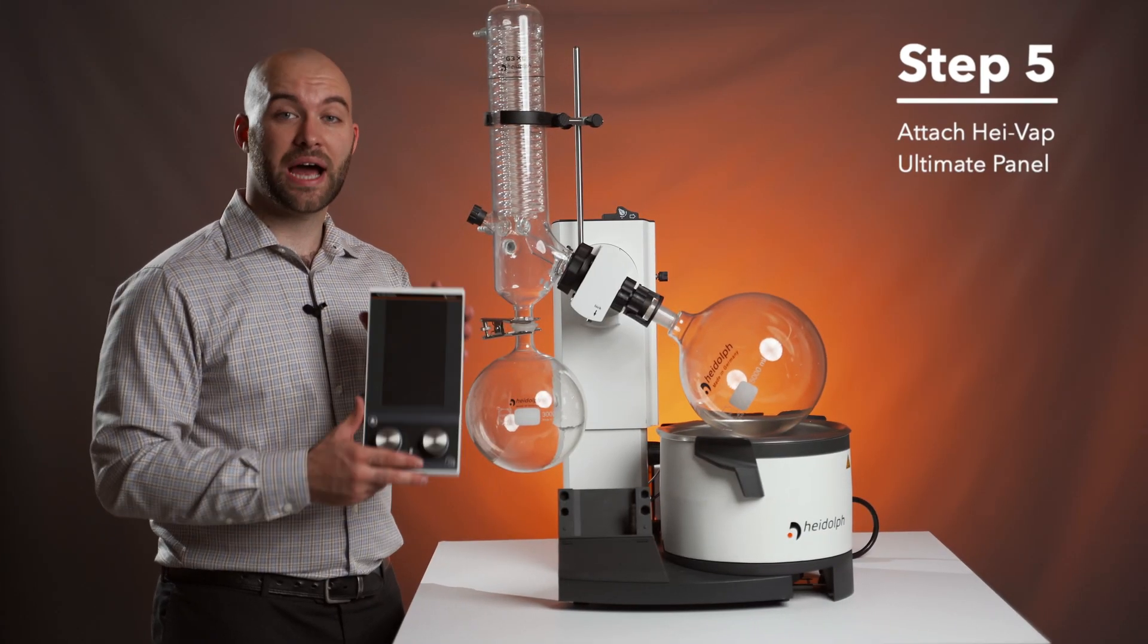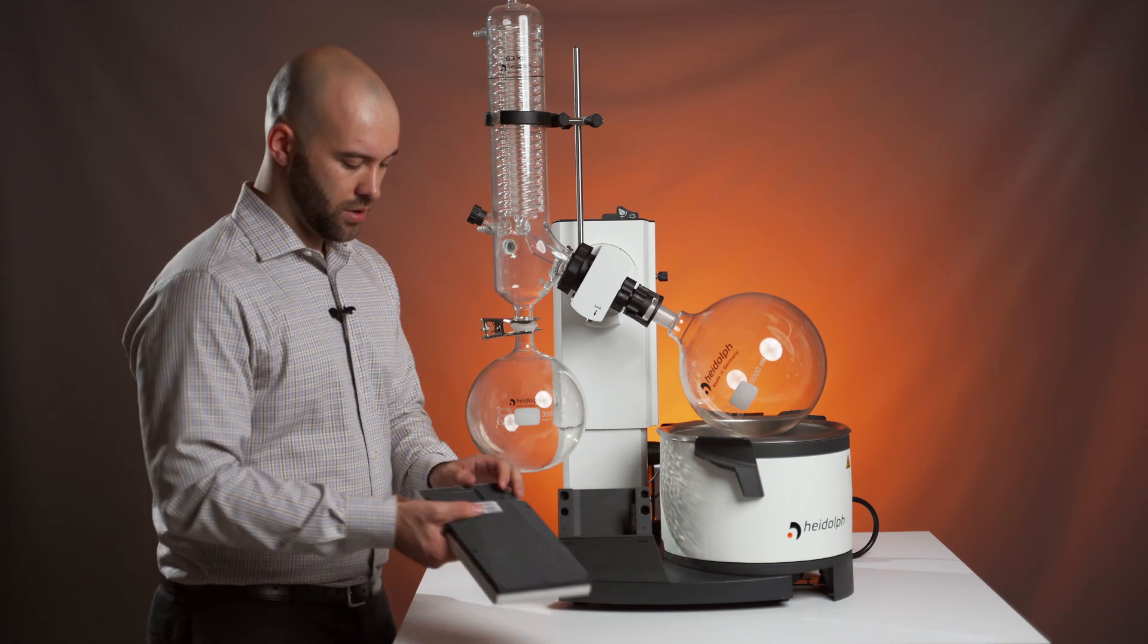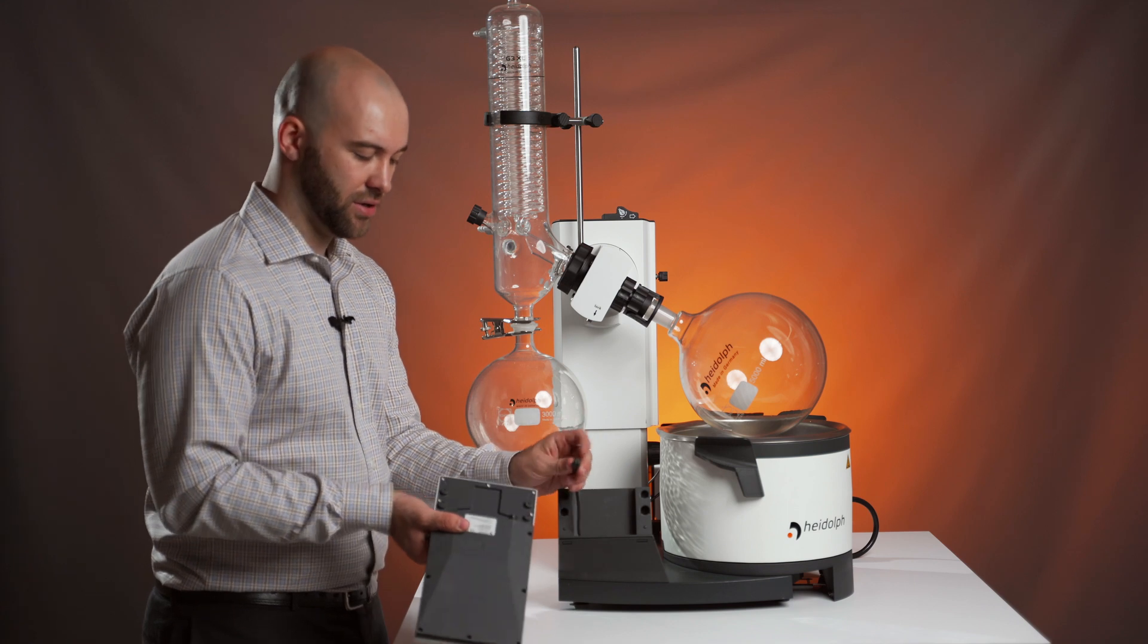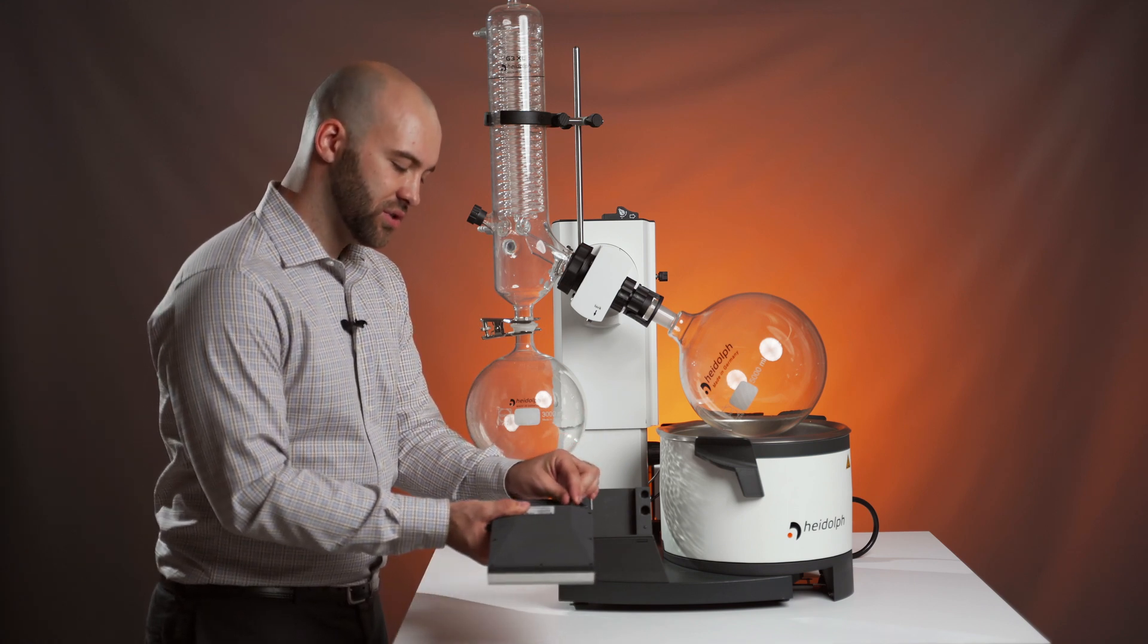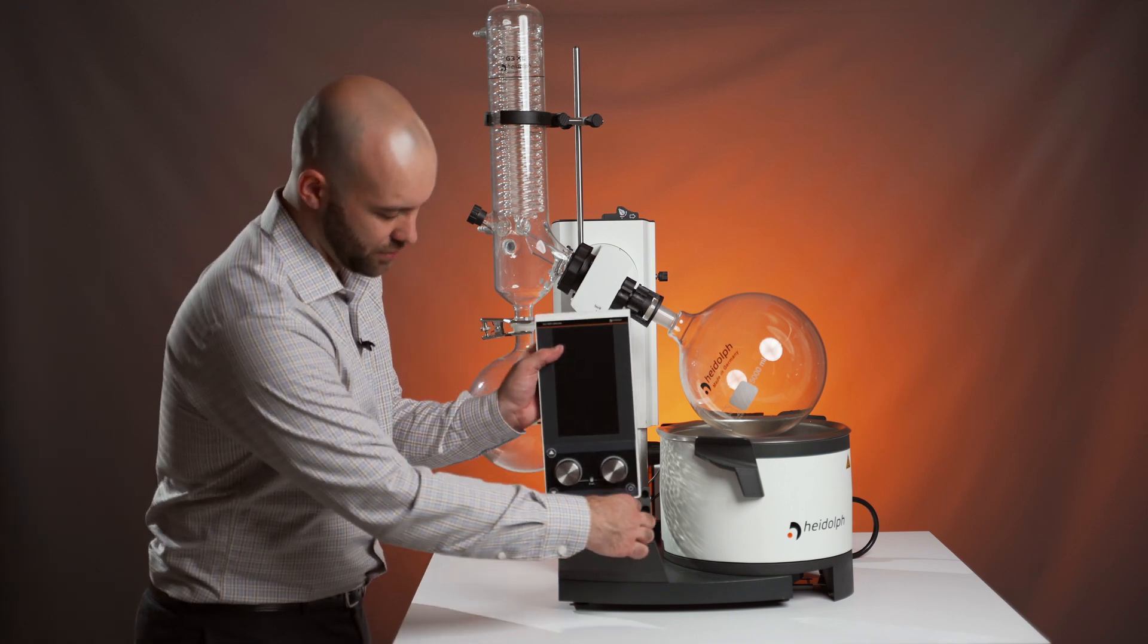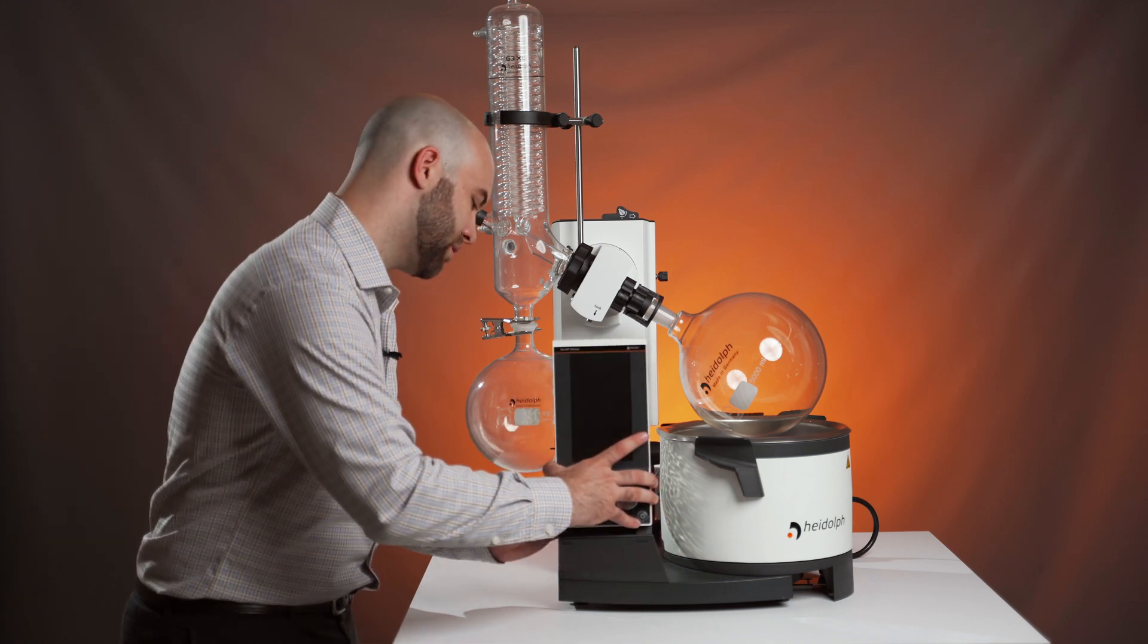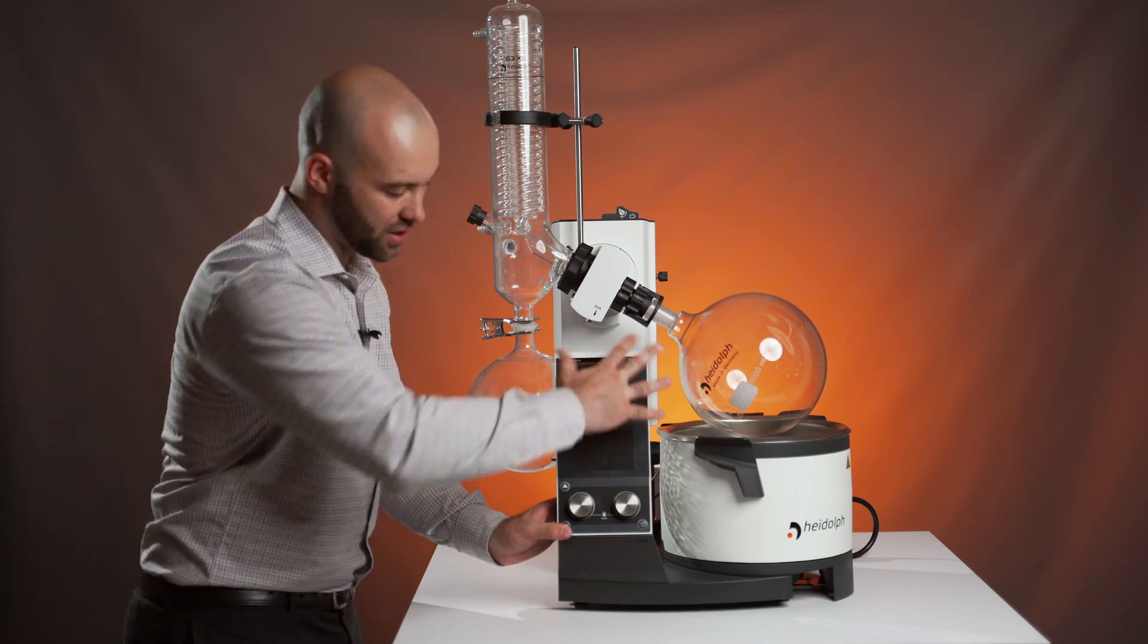Step five, we're going to attach our HiVap Ultimate panel to our HiVap. You're going to see a white notch on the back of the panel, and the white notch on the cable on your HiVap. They're going to slot into each other to connect, and you're going to slide this cable back down through the hole, line up the four slots, and push down until you hear a click.